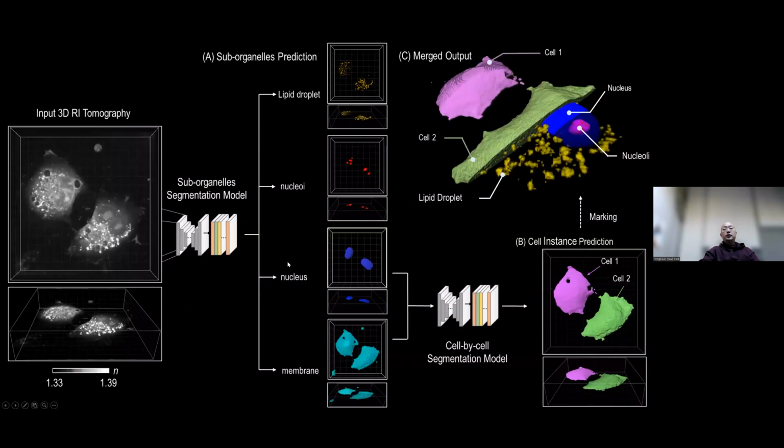So we have further developed the algorithm for segmentation. Now we are able to perform segmentation of subcellular organelles from this one input data. We are internally continuing to improve this algorithm so that it can be readily used by the users.